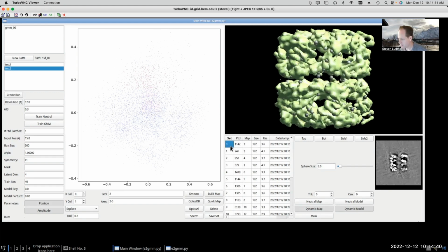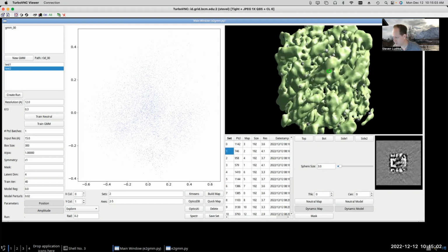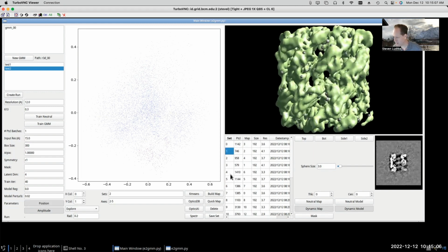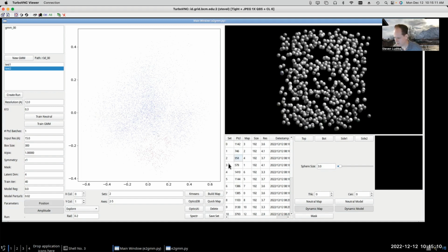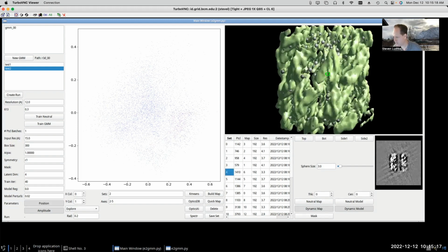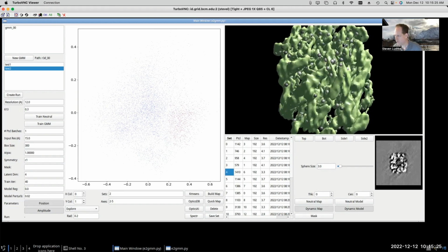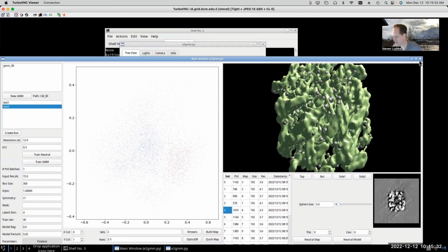If we look at the k-means segmentation, we can look at each of these different maps, and we'll see that a couple of these seem to have sort of pulled out specific orientations. There may be some orientation preference. This is kind of a risk on a smaller data set. This has only got like 8,000 particles in it. So each of these individual maps that we're looking at only has a few hundred particles in it, which means that there's an opportunity for there to be a preferred orientation that's getting classified out of the data. If you have a 100,000 particle data set, then you will tend not to see that kind of thing happening, right? So this one's particularly pronounced, where you can see this smearing out along an axis because it was missing particles in other orientations. Anyway, so this is sort of how the system can work and some of the issues that you might run into.